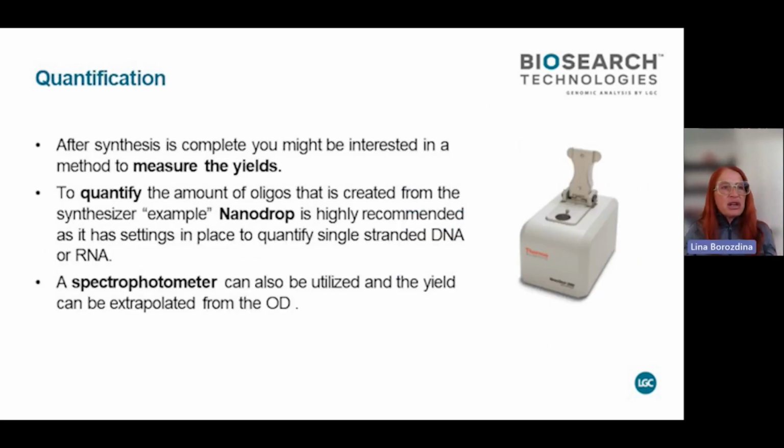Quantification. Doesn't matter. You've been in a lab, you know what your 260/280 reader is. This little device is a NanoDrop, so this is for individual measurements. However, if you want to use 96-well plates, there are different OD readers, your 260/280.